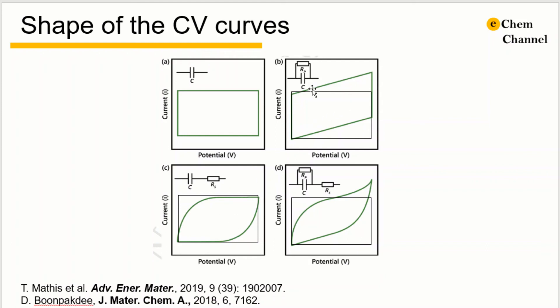When there is a presence of a series resistor, the area is smaller than the ideal CV. So this indicates that the practical capacitance is actually smaller than the idealized case.